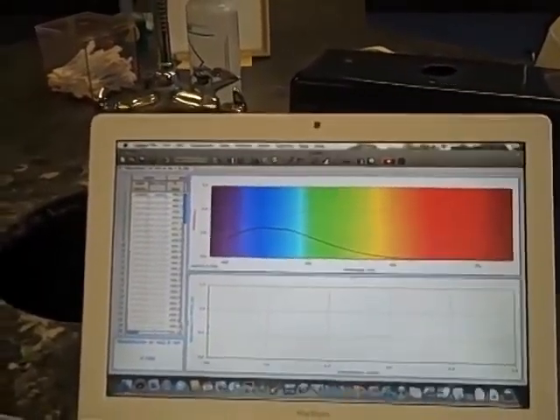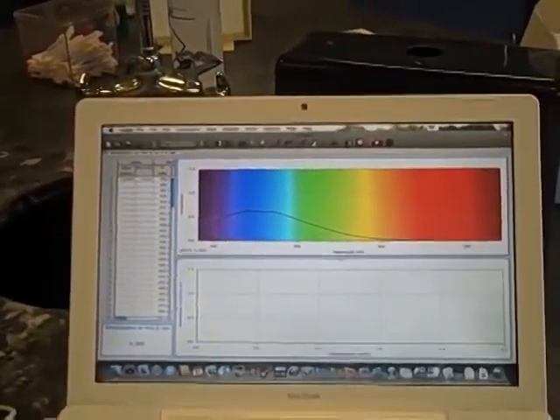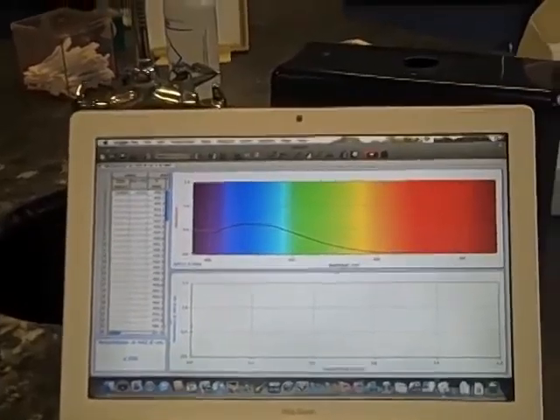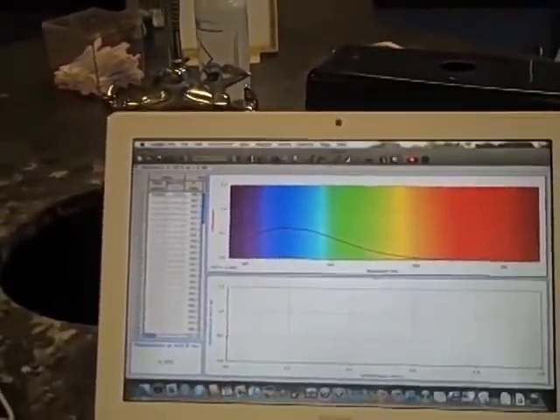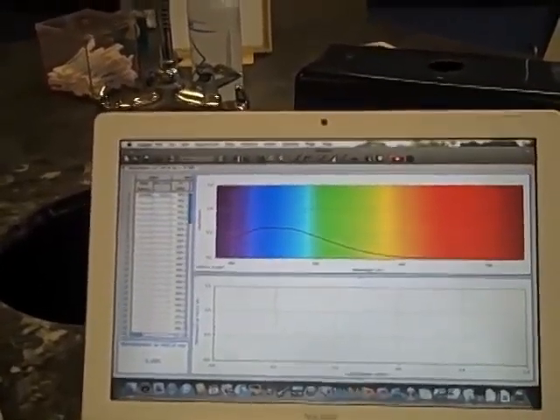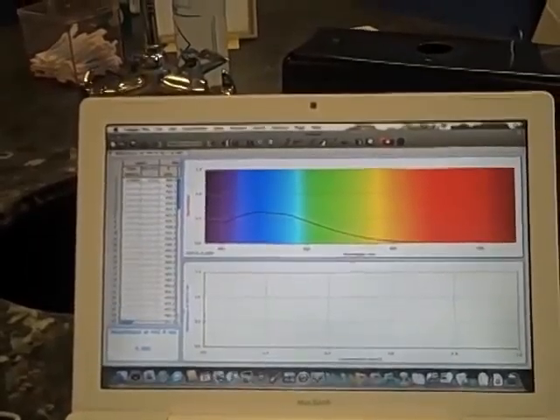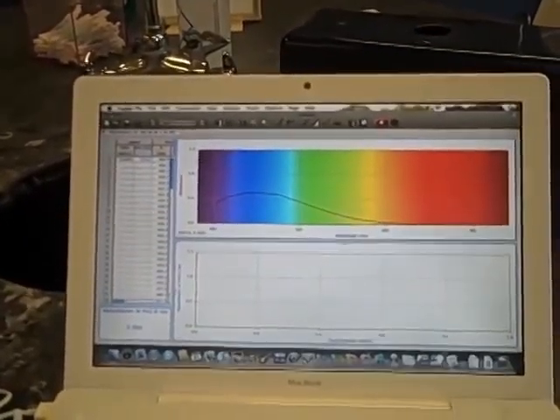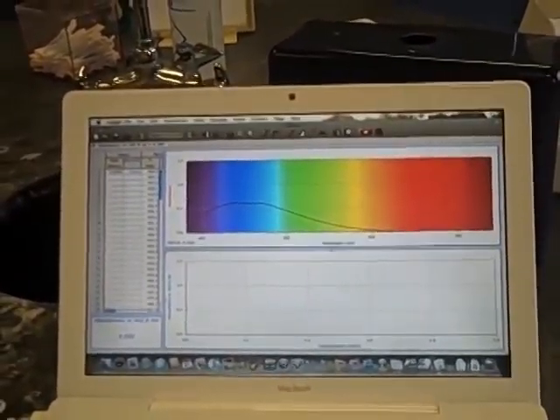solution. Okay, and so I noticed that the second one looks like it's a lighter concentration. So what do you expect the absorbance to be? The absorbance on the last one was 0.632. Do you expect this absorbance to go down then? Yeah, this one should be a lot lower, and it should get increasingly lower as we keep going. So number 3 will be less than number 2, and so on.